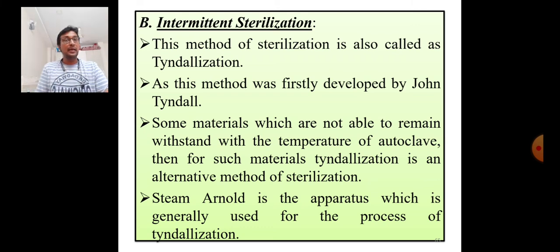This is again one type of moist heat sterilization method, that is intermittent sterilization. This intermittent sterilization method is also called tyndallization.